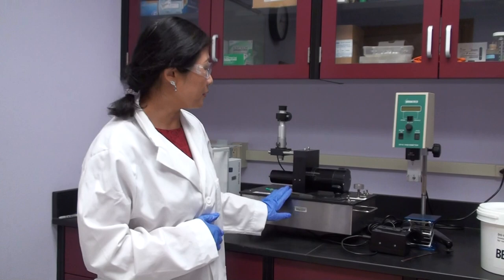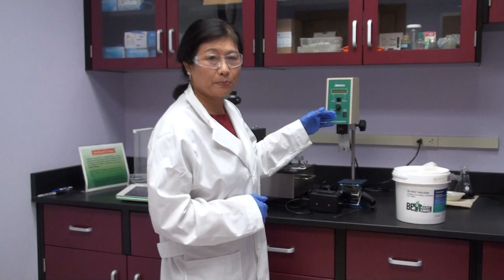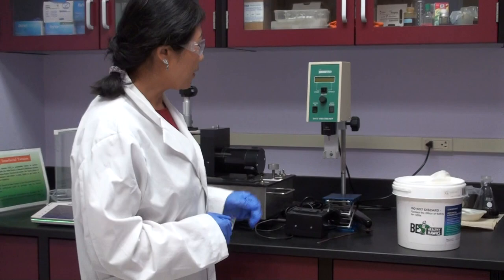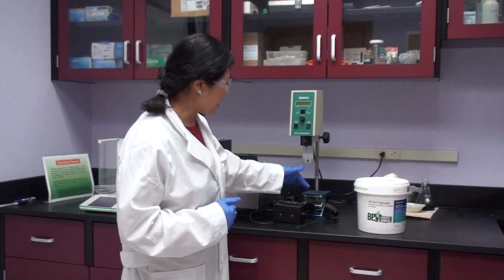The next one you see, this one we call the Brookfield low viscosity viscometer. We use this equipment to test the liquid viscosity, for example, test type water, surfactant solution, or polymer solution.